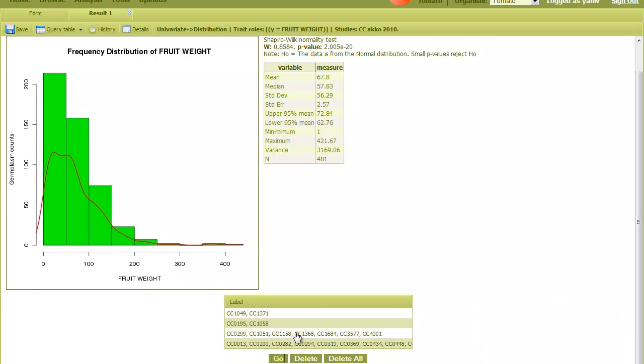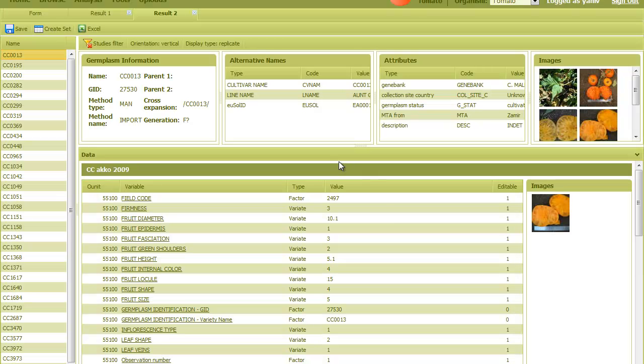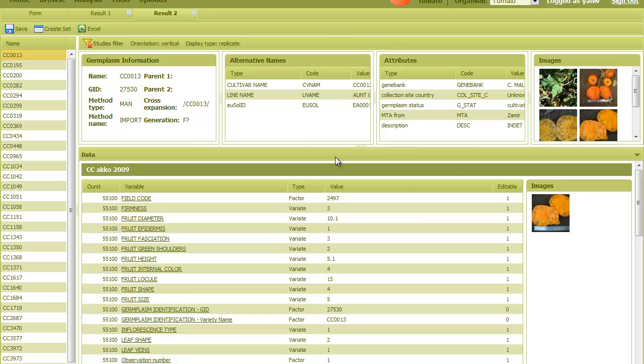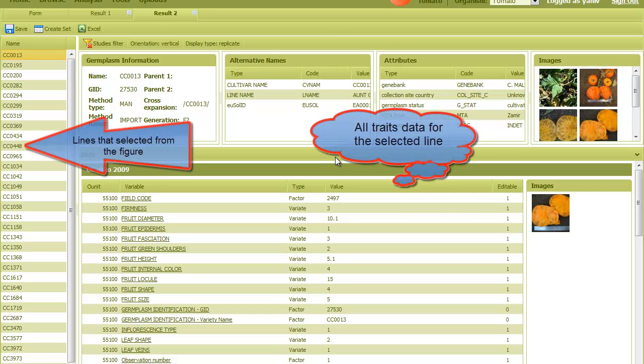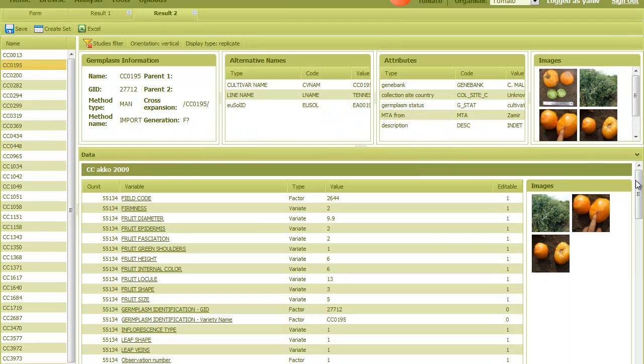Then I click over here, and another tab is opened that shows all data for all traits of the selected lines, including images. So I can browse the lines and see all the data about them.